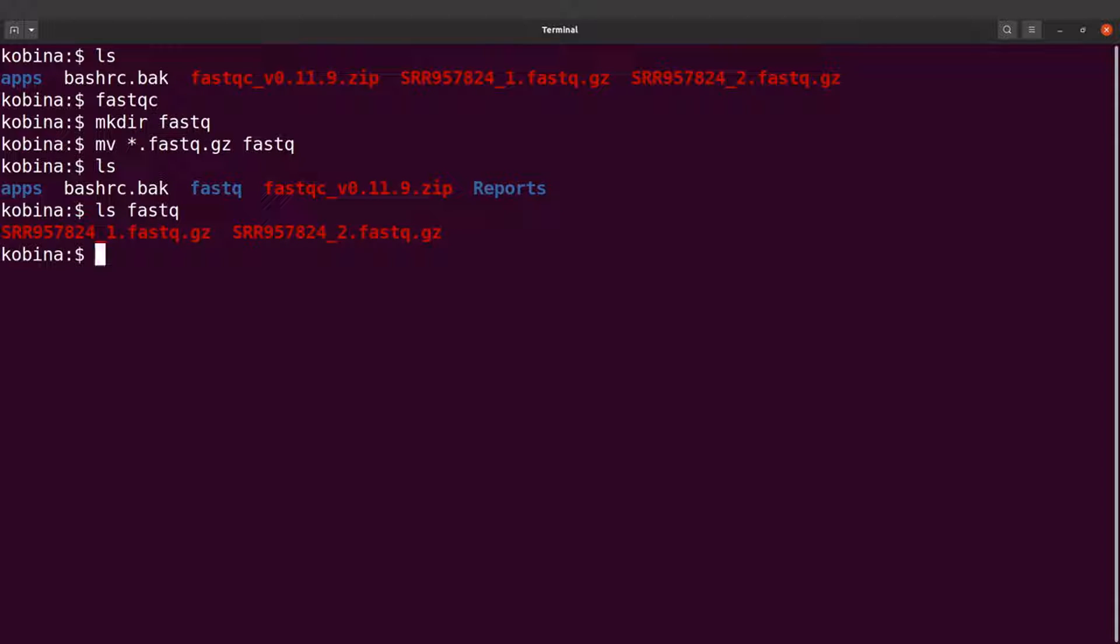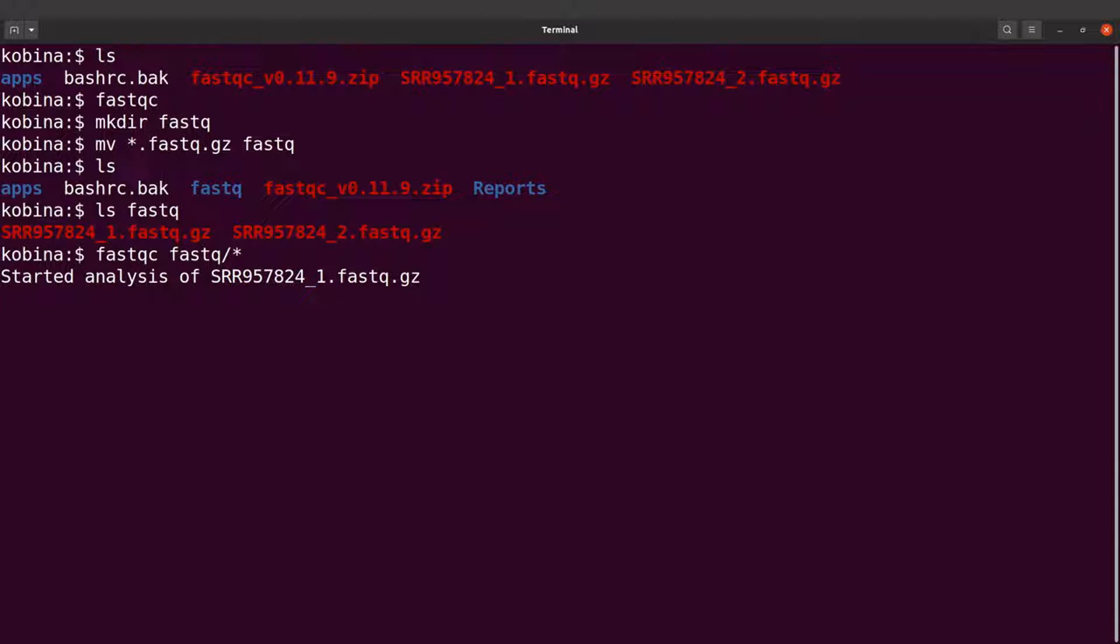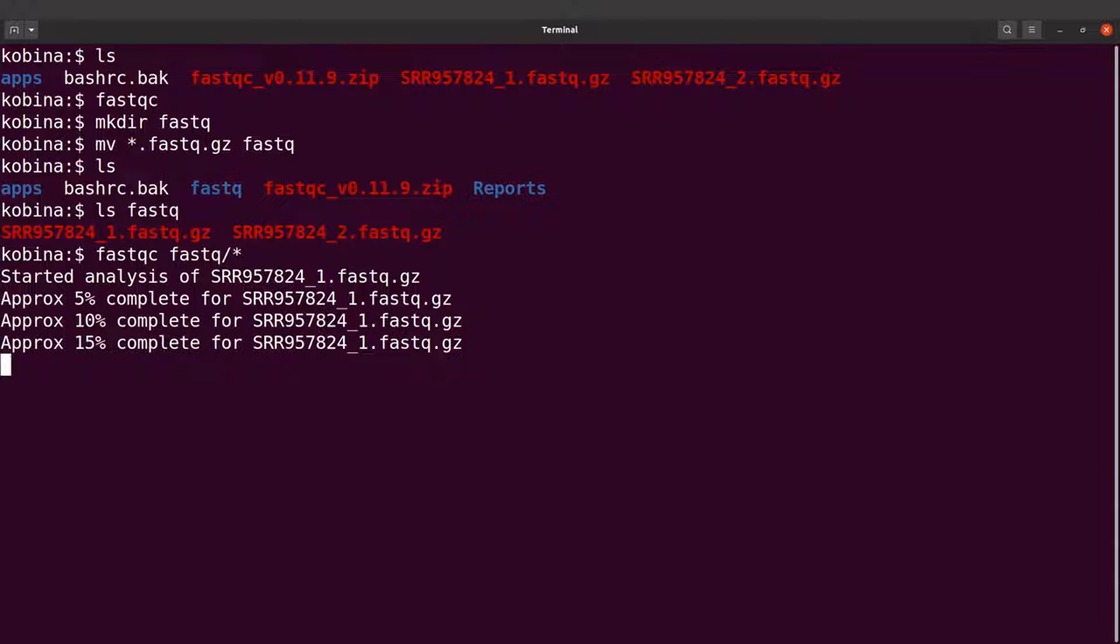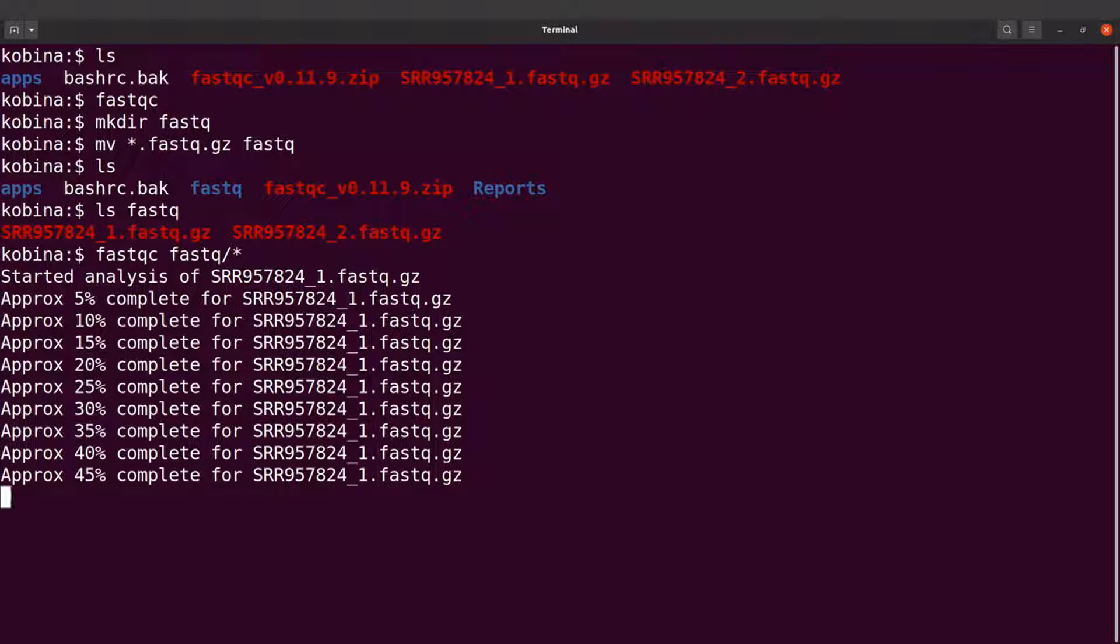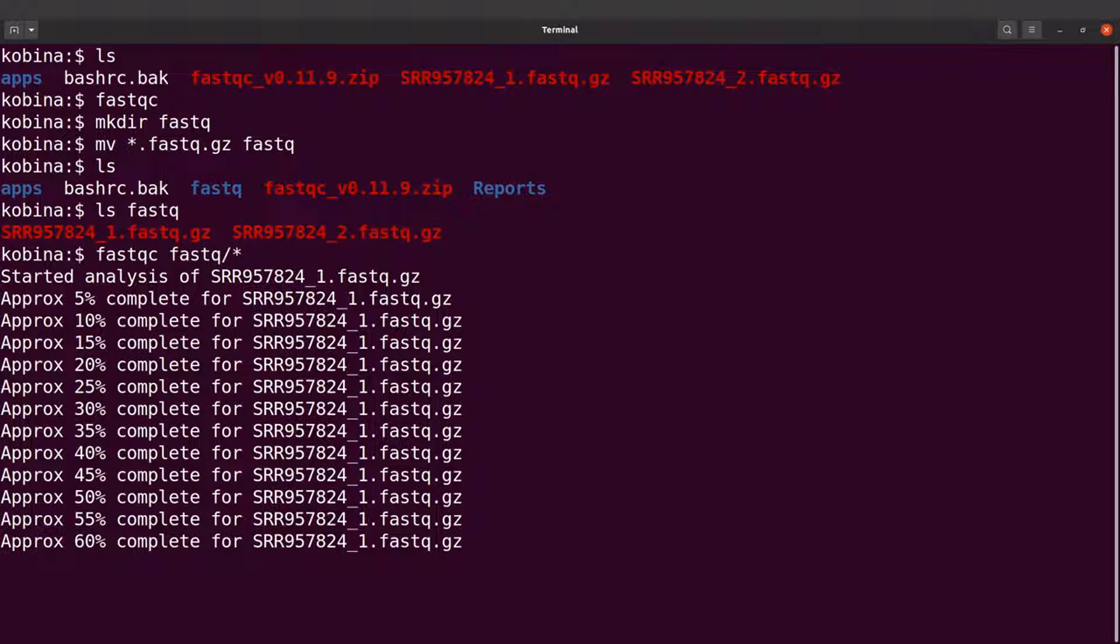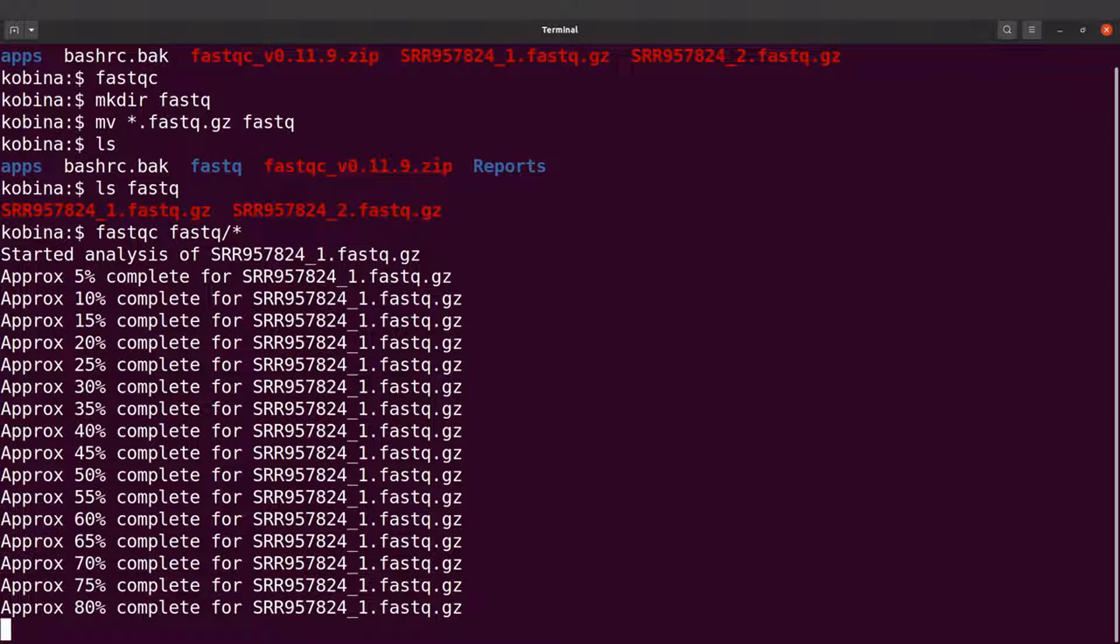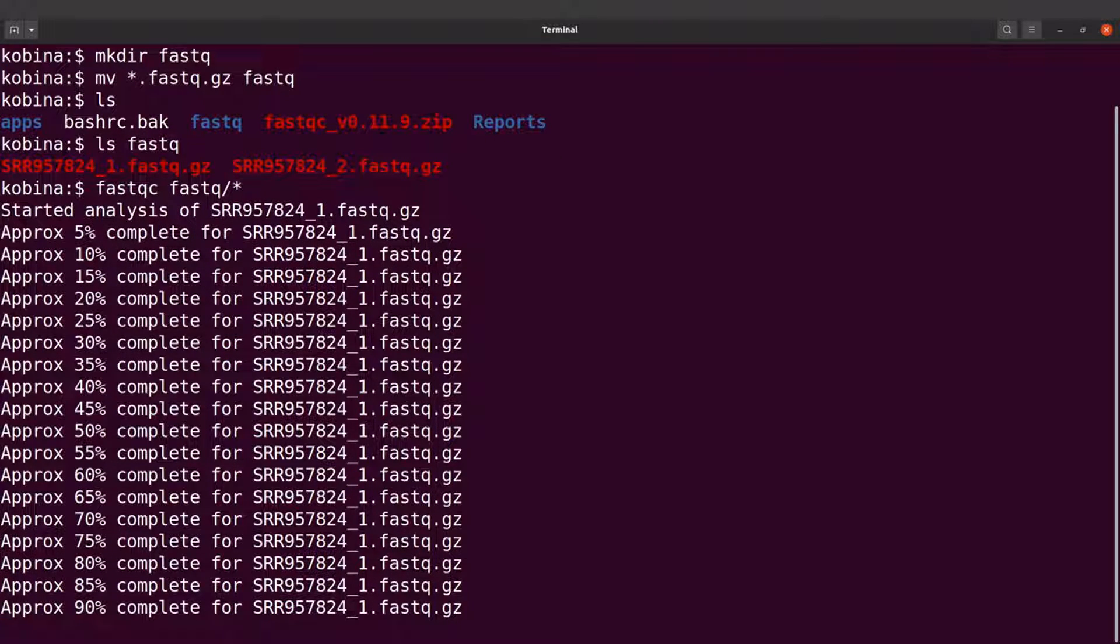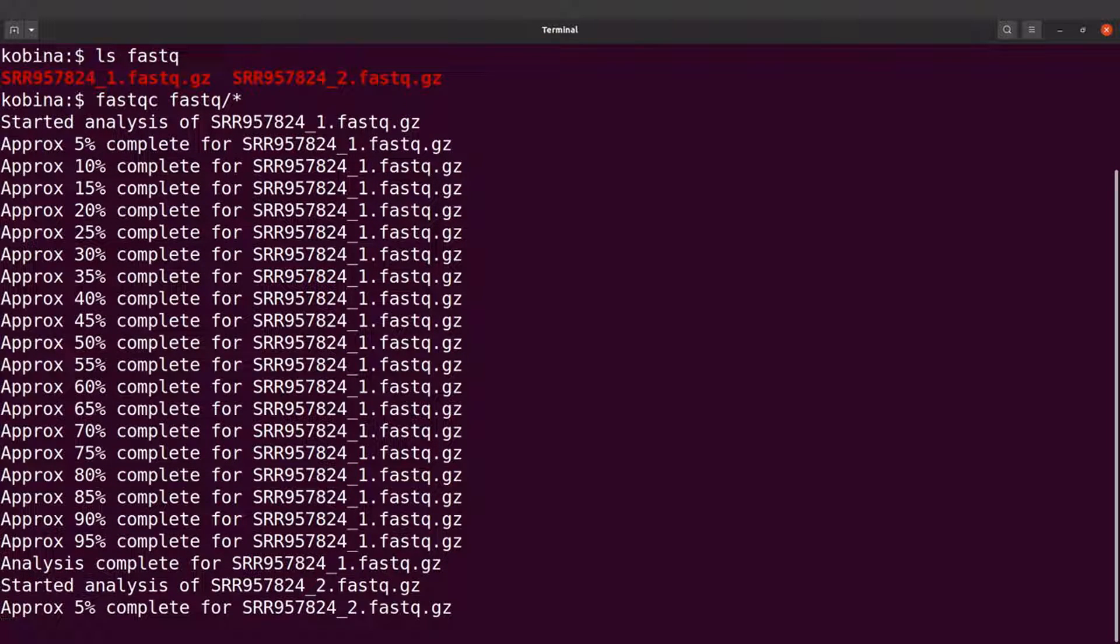Now I'm going to run FastQC on these. If you want to run FastQC on all the samples or all the files here, you can say fastqc, then specify the directory slash star, and this will run everything for you. This will run everything just like how we selected all the files when we opened with the graphical user interface. If you're using command line, the reports are automatically generated for you. Once it's done, you will see some files also there.